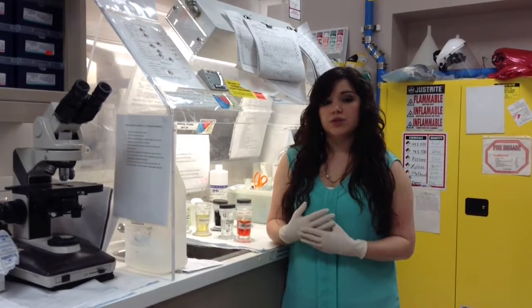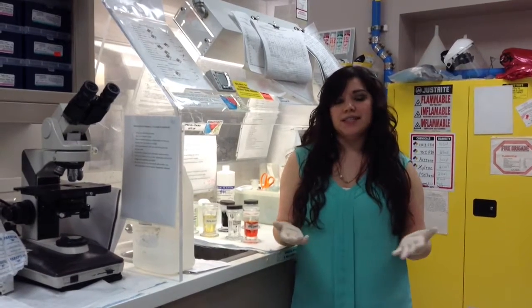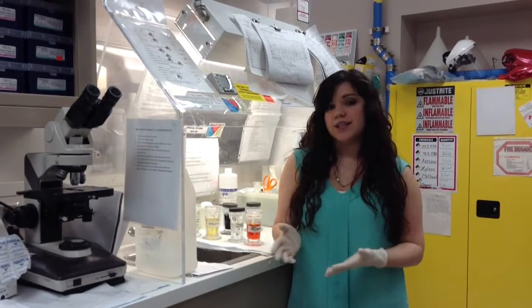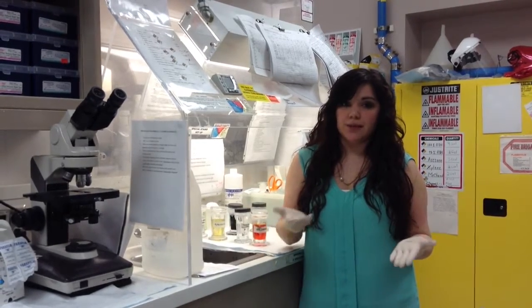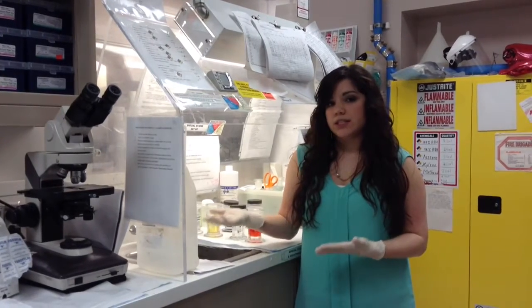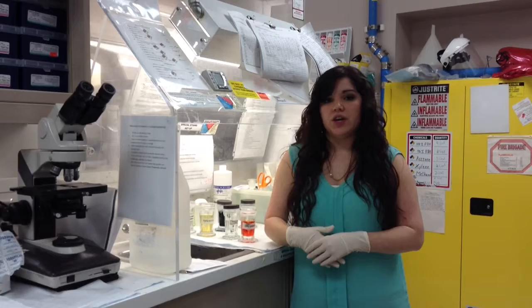Also, because it's day 3, you will have the opportunity to let the student request to process some of the other specimen types that they experienced challenges with in the past 2 days. For example, if it's already day 3 and they've been practicing but struggle with smearing still, you can give them that opportunity at this time, especially if you receive a low volume of bronchials. As you know, in this laboratory, we don't receive as many bronchials as some of the other specimens.